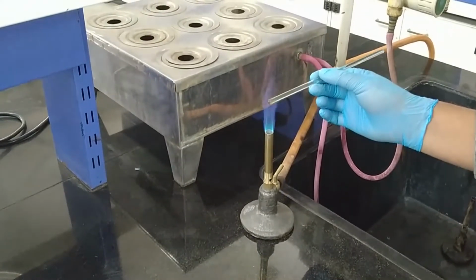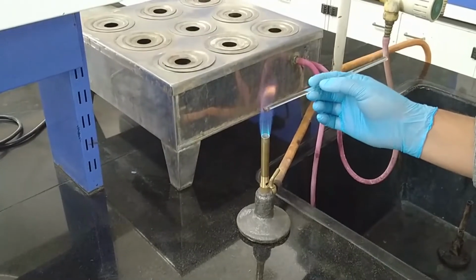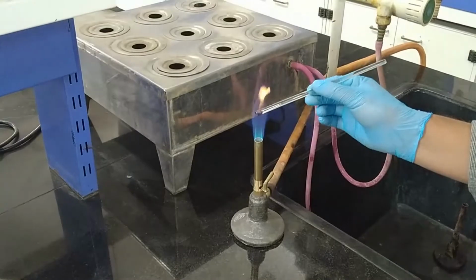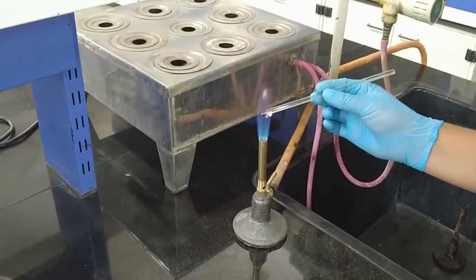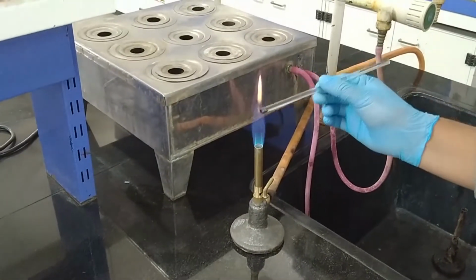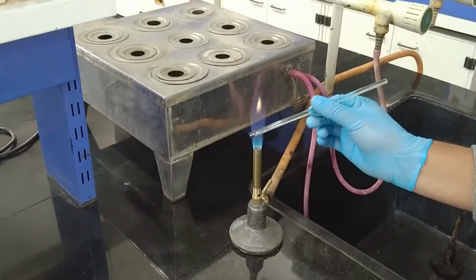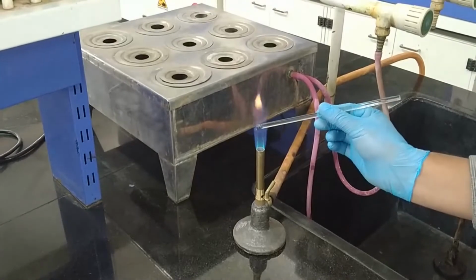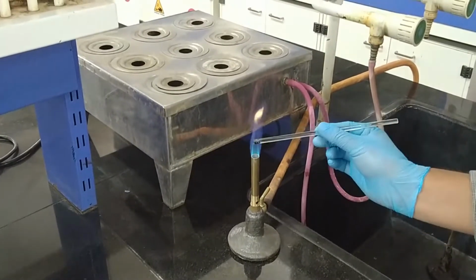One is the sooty, another one is the non-sooty flame. So here you can find this gives you a non-sooty flame. Okay, if it is sooty, then it should burn with golden yellow flame like candle even after removing from the flame. Okay, but see, this is not showing you a golden yellow flame.